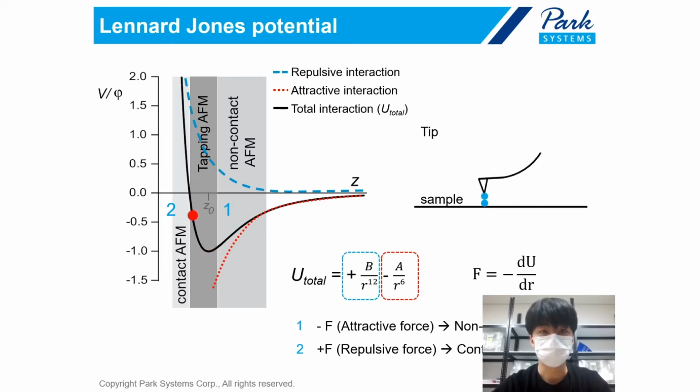And if the tip gets even closer to the surface, the tip feels repulsive force more than attractive force. So we use this region for contact mode. So again, we use attractive force for non-contact mode and repulsive force for contact mode.